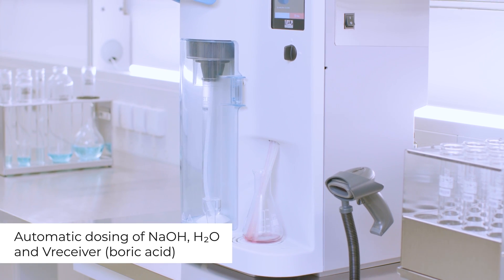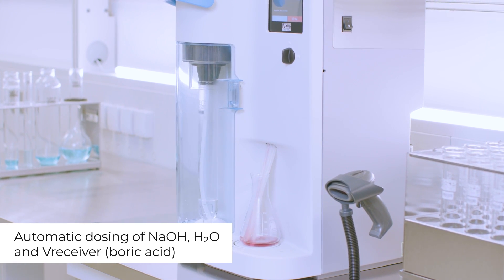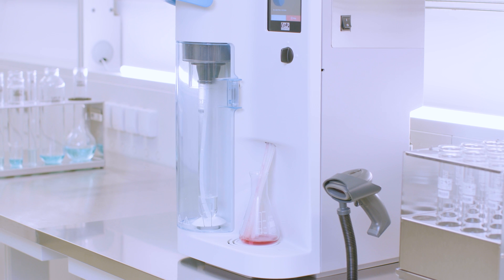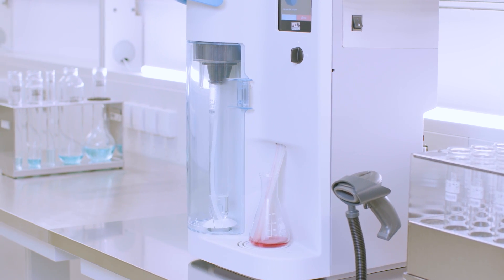The reagents are automatically dosed with extreme precision, providing a simple and safe operation for reliable analytical results.